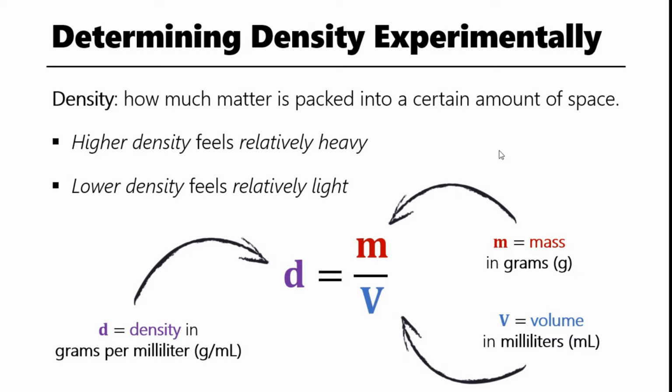Something with lower density typically has lighter atoms that have more gaps, more spaces in between, a more open structure where things aren't packed as efficiently. In either case, you can feel out whether something seems pretty dense or not so dense, whether something is more or less dense than another, but in science, we want data. We want to have a number on something to tell us exactly how dense something is. So we use the mass and volume to do that.